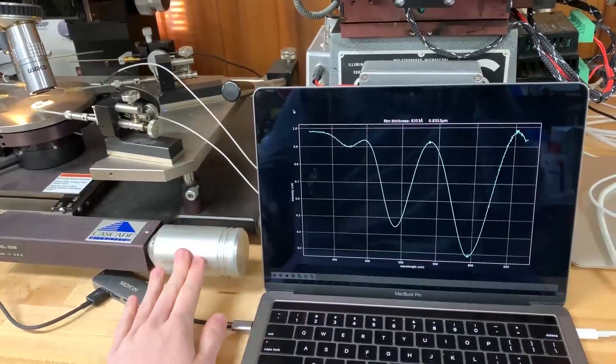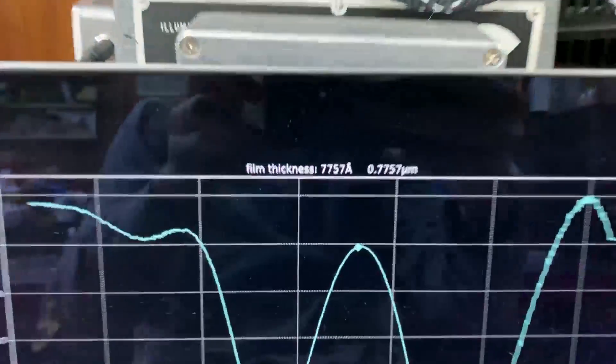So I'm here on the home chip fab and I want to show you a pretty simple way to measure the thickness of thin films that are on the order of a few nanometers to a few microns using only an optical spectrometer that I picked up off eBay like everything else here and a white light source.